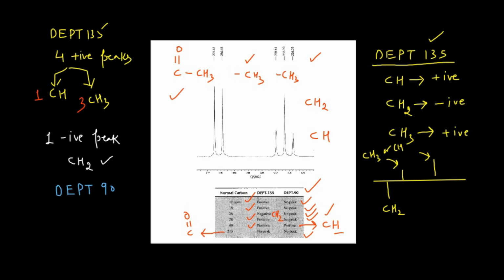And one more important thing you can observe here, in this particular spectrum, where in the bottom part your DEPT NMR data is given, right? In the upper part, you have been given a triplet here, okay, and a doublet. Triplet and doublet you are having. So how can you get your triplet? You can get a triplet in this manner only: your CH3 when connected with the CH2, okay, that means it will give you what?